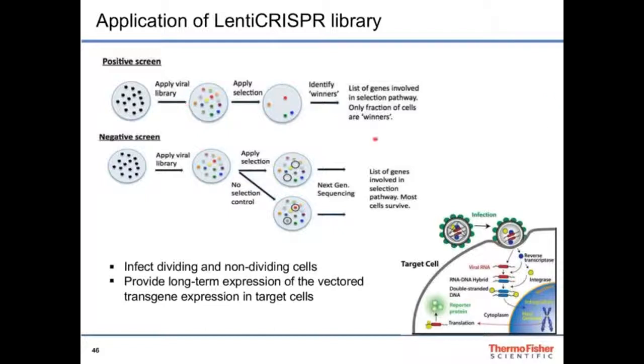We can do survival screens. We can do these knockout experiments in some of our reporter cell lines. For instance, we have reporter cell lines that have a fluorescent reporter that indicates activity of a particular kinase cascade. So now we can do knockout screens in the presence and absence of maybe small molecule drugs and overlay that with activity of a particular kinase cascade.